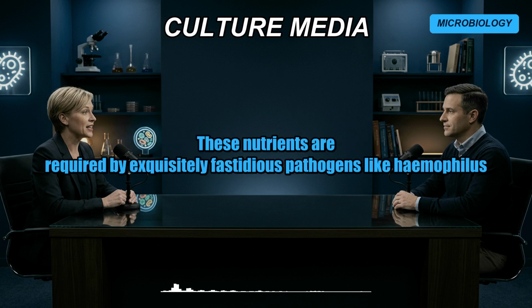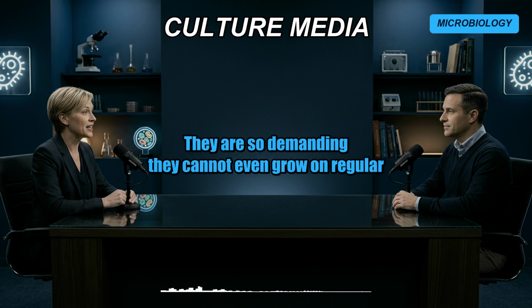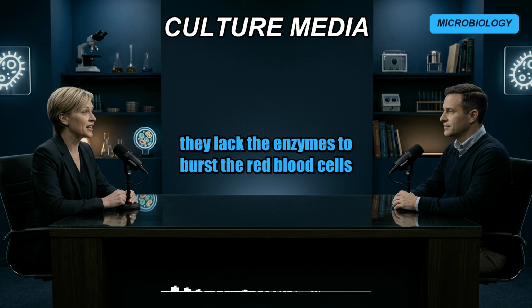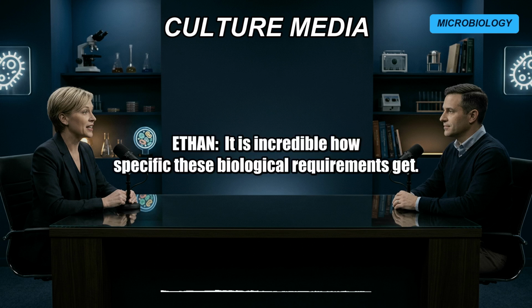Right. These nutrients are required by exquisitely fastidious pathogens like Haemophilus influenzae and Neisseria gonorrhoeae. They are so demanding they cannot even grow on regular, unheated blood agar. Wow. Yeah, they lack the enzymes to burst the red blood cells themselves, so they need you to cook the blood and break the cells open for them first. It is incredible how specific these biological requirements get.